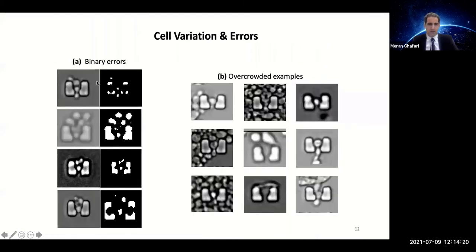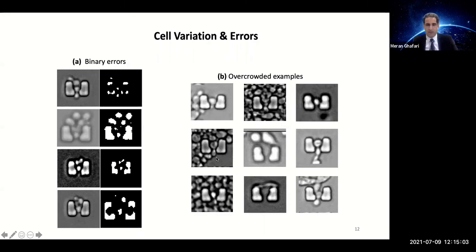When we did this classification, we had many errors. In one case, a trap with four cells was considered as a single cell due to image intensity. In another, so many extra cells were detected in a noisy region. Two cells attached closely were detected as one, and overcrowded situations made things worse — when many cells surround the trap with similar intensity, large false detections occurred.